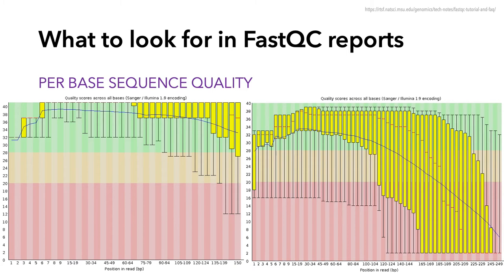The first FastQC module is per base sequence quality. This is one of the most basic but useful QC modules. In FastQC it's represented as box and whisker plots, and the blue line is the mean quality score. It's totally normal for Illumina data to start out lower, then increase, and then gradually drop over the length of the read. On the left we have an example of good data where all but the last few positions are entirely in the green. On the right, in contrast, is a plot from a bad sample where things drop off into the red pretty quickly.